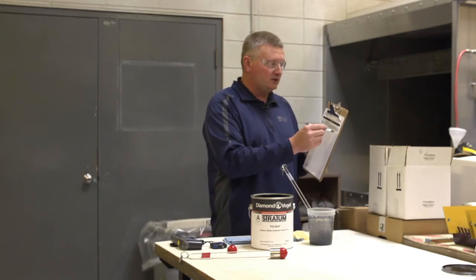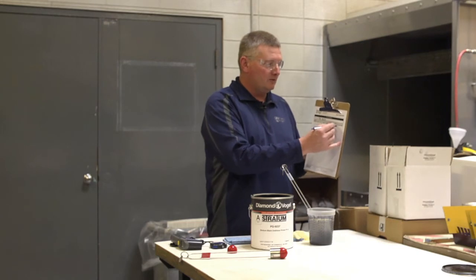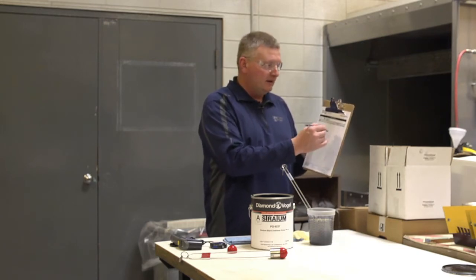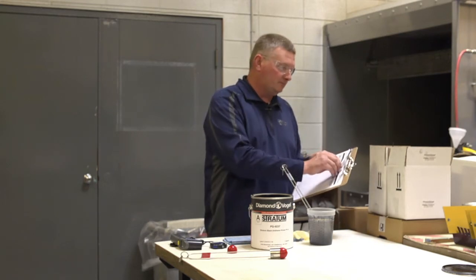With that being said, if you need to change your viscosity, over here in solvent added you would write down how much you added and what you added. Then obviously you would need to mix it again and record what you changed it to at that point.